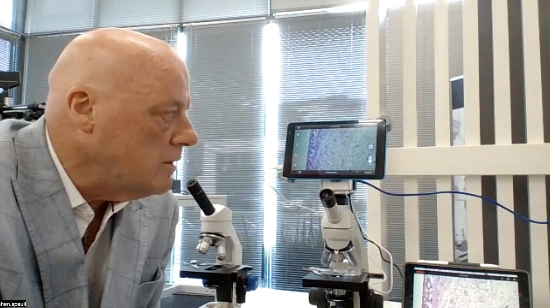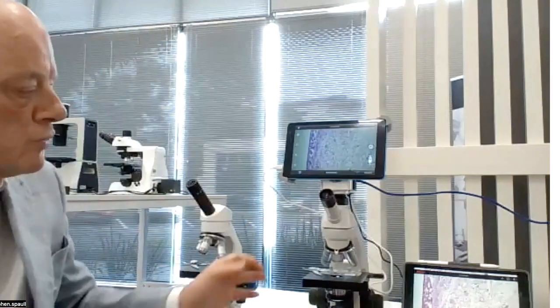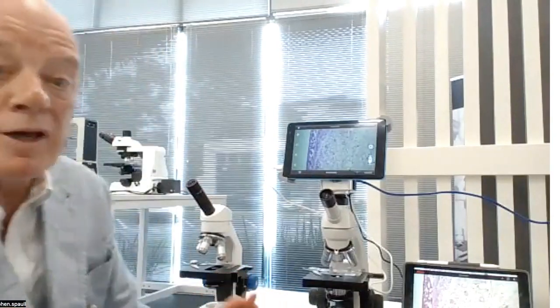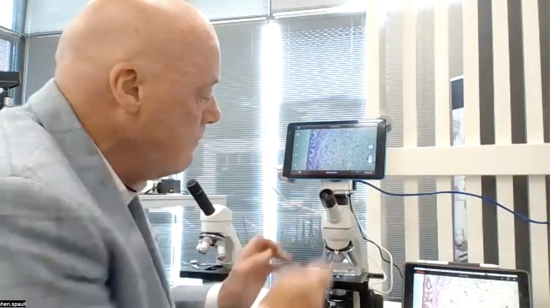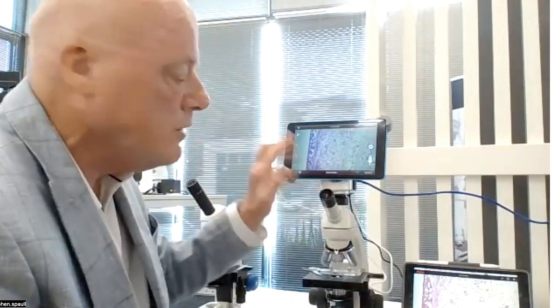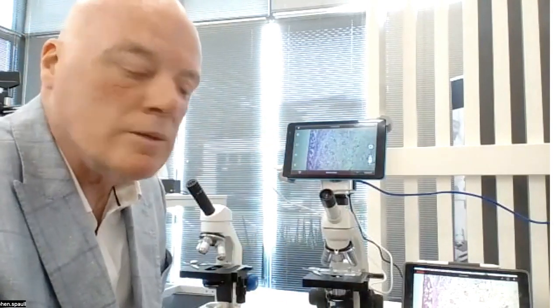Once you've got that connected up, then you need to adjust your controls on the microscope looking at the screen. It's the simplest way of doing it. It's the only way you can probably do it. So you get the image in clear focus there. Once it's clear, you'll probably notice that the difference between what you're seeing there in the eye and the screen is slightly out. That's where you make your adjustments.